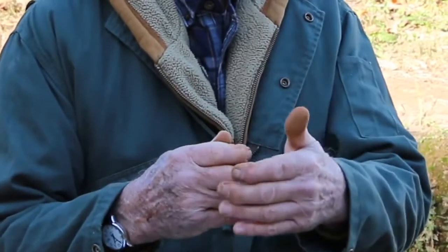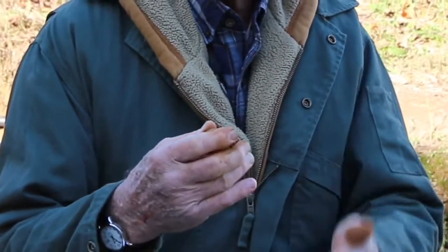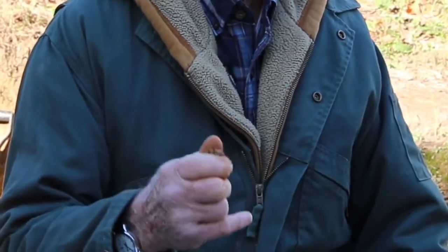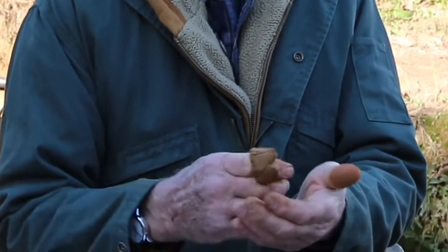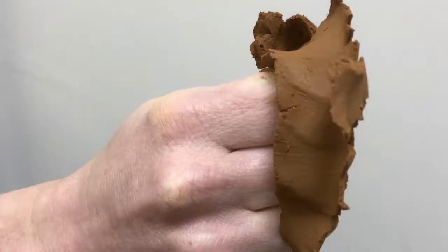A fine textured sample, on the other hand — something that exceeds 40 percent clay — typically you'd moisten it and the ribbon would form and come down around your hand, exceeding three inches. Some soils in the state are clay and sticky enough that they'll come down around your hand and the ribbon can be four or five inches long.